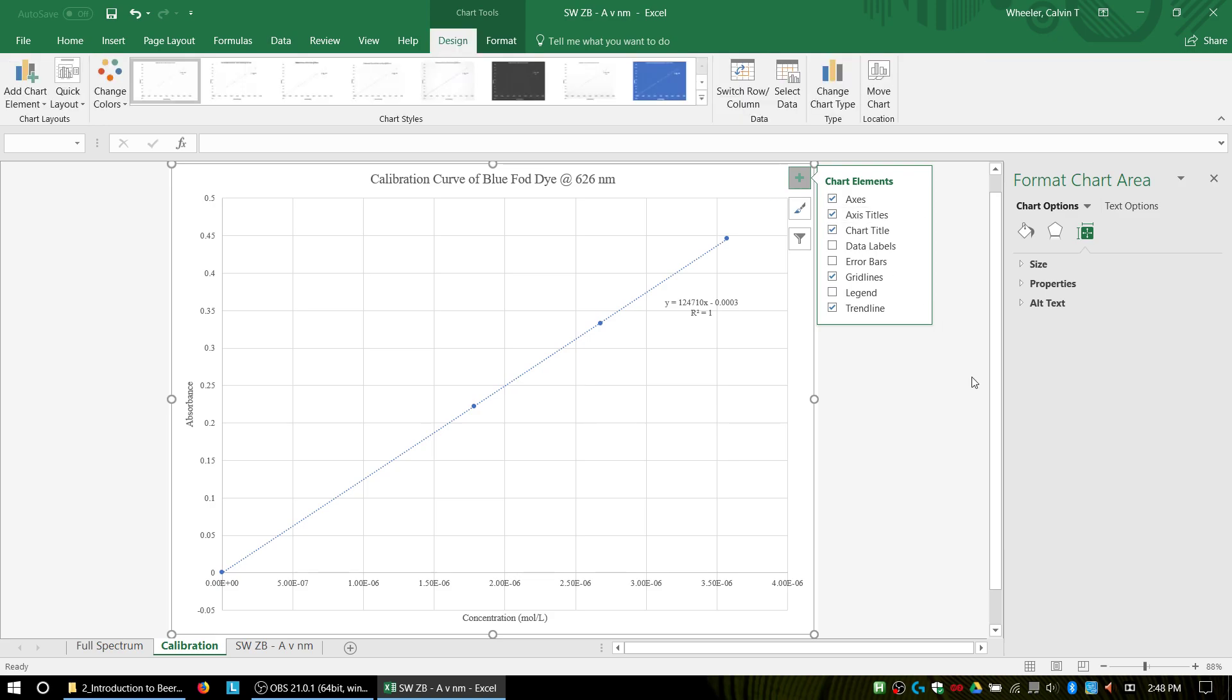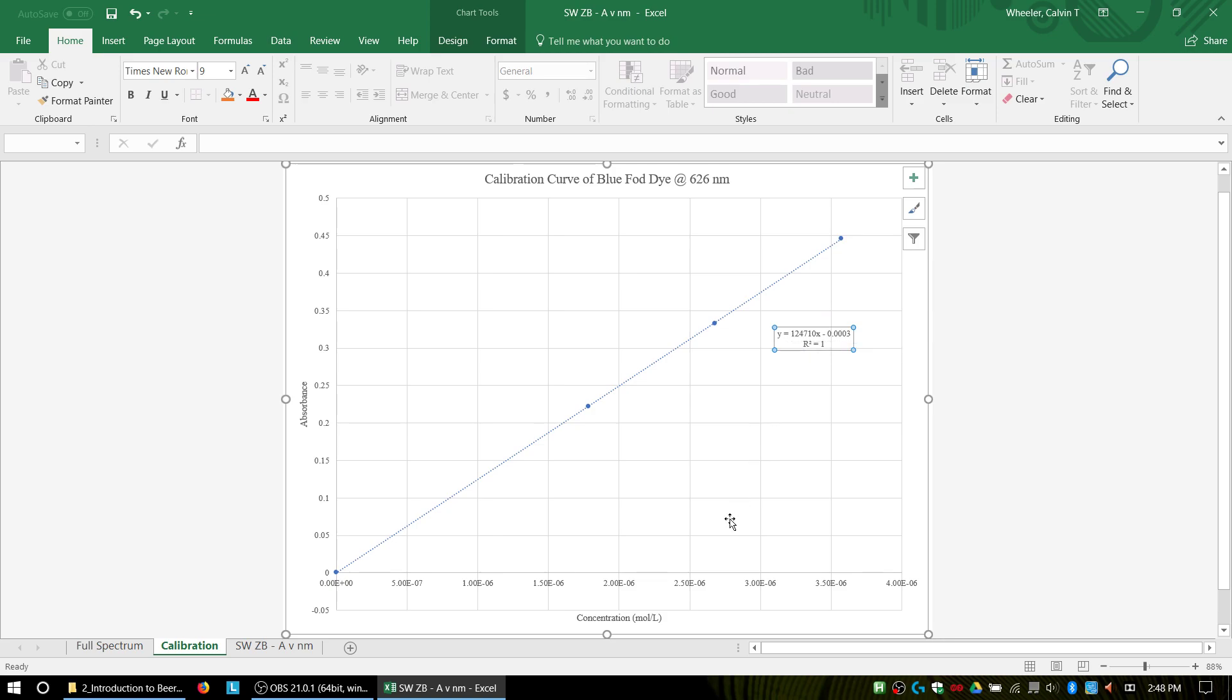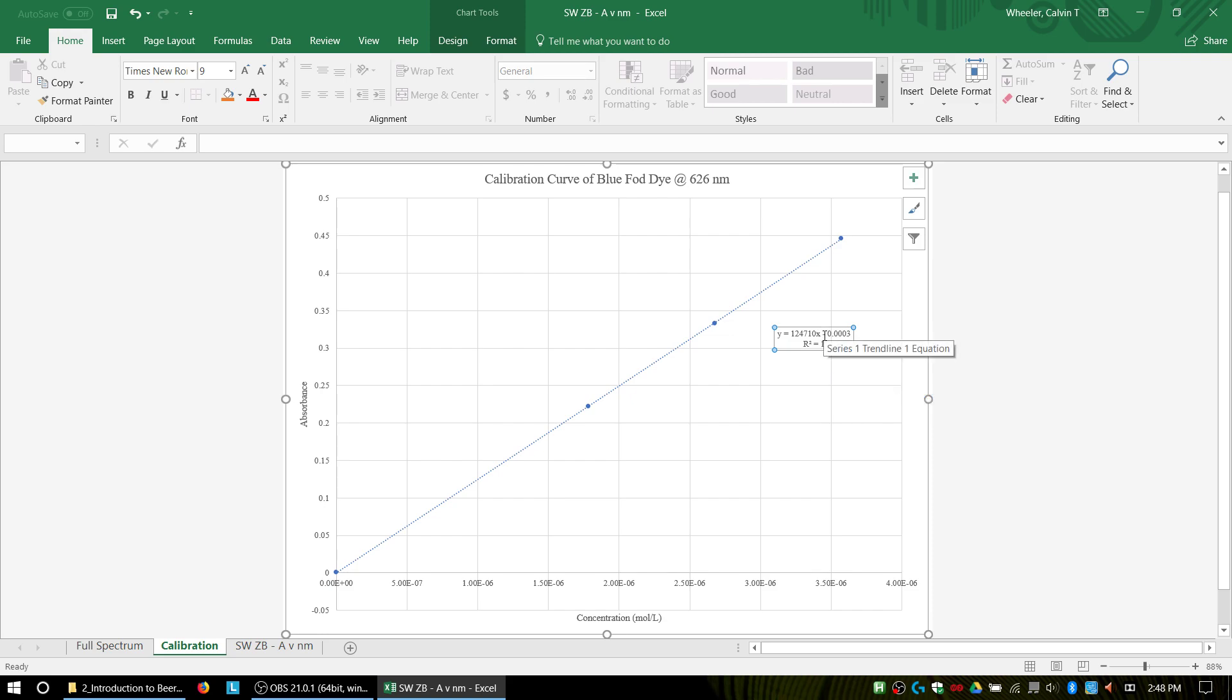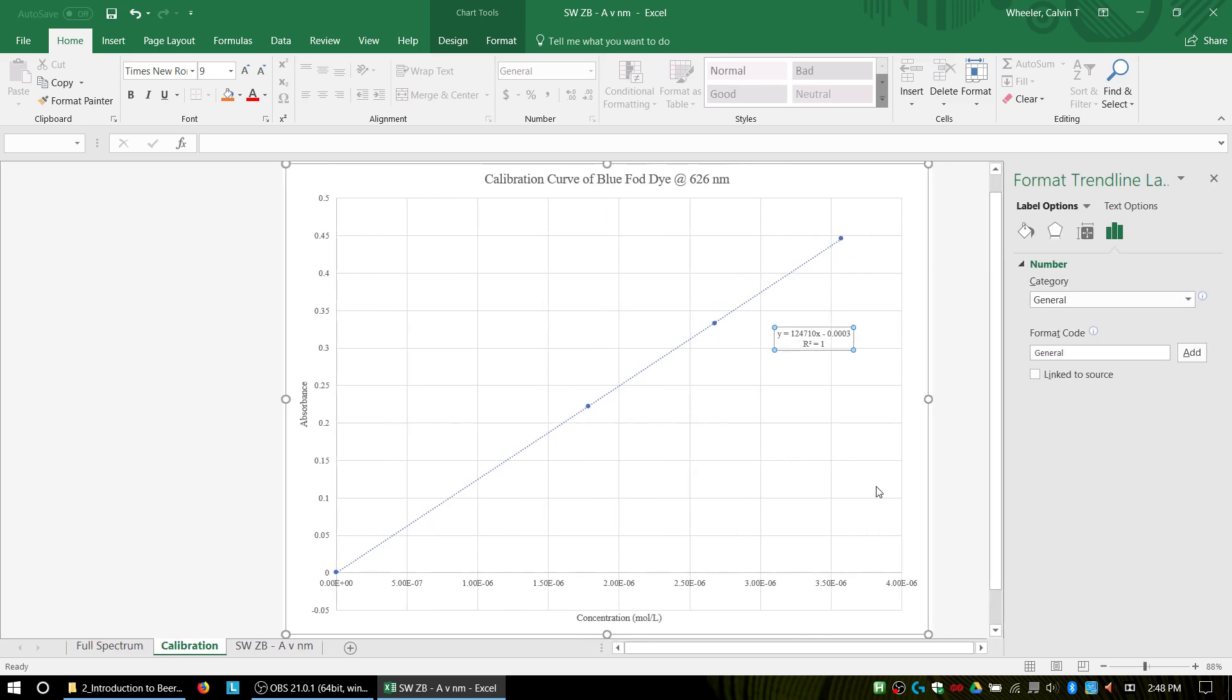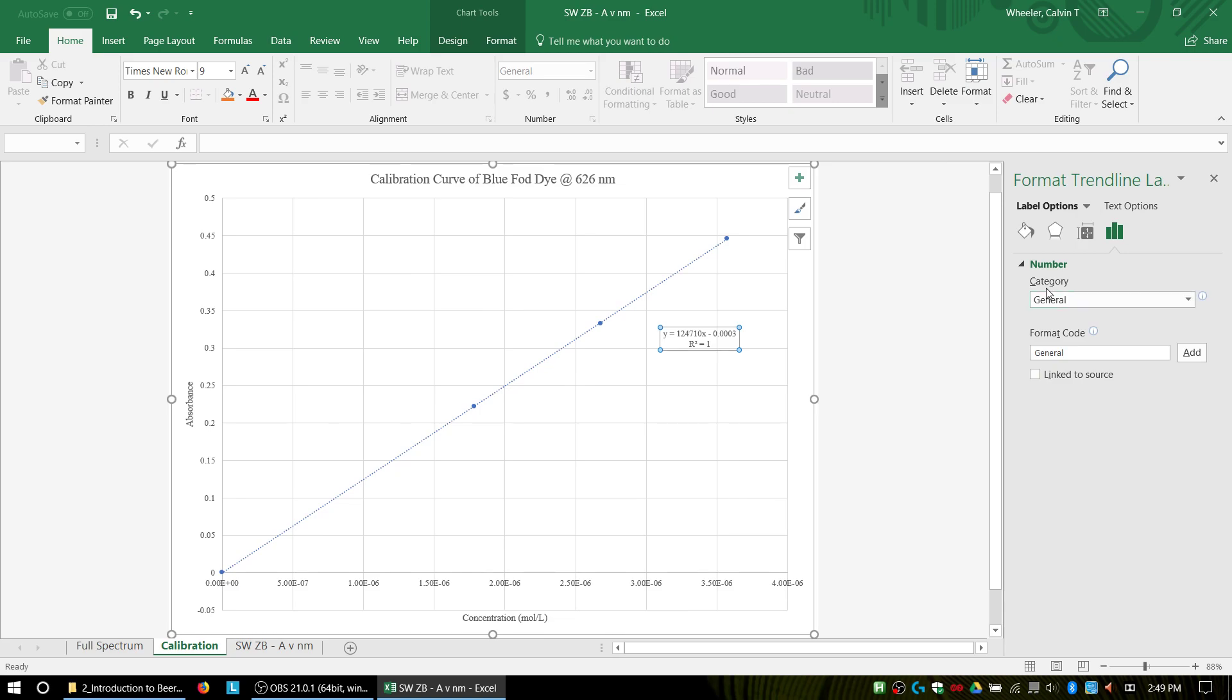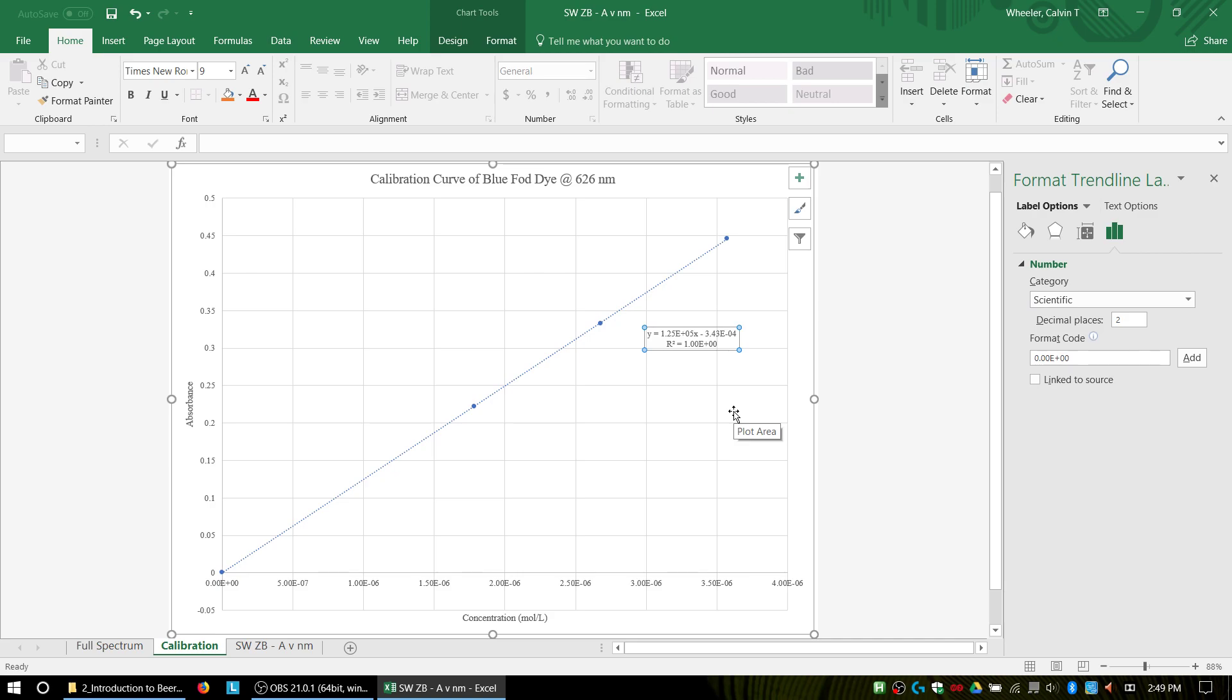You will notice that this has more sig figs than we actually would have from our data. And so we want to change this so that it's only showing the appropriate number of sig figs. So to do that, you're going to right-click on the label. And you want to format the trendline label. We are currently in the category of general numbers. We are using this for science. We're going to go down to scientific numbers. And it's going to put everything in scientific notation for us. And we want two decimal places because we have three sig figs. And that looks good to me. So close that out.